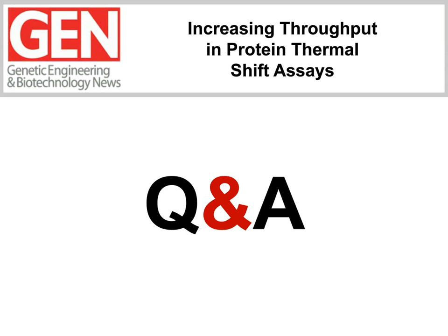All right. So on to our next question. One of our audience members would like to know, can the LightCycler 1536 do anything other than thermal shift assays?